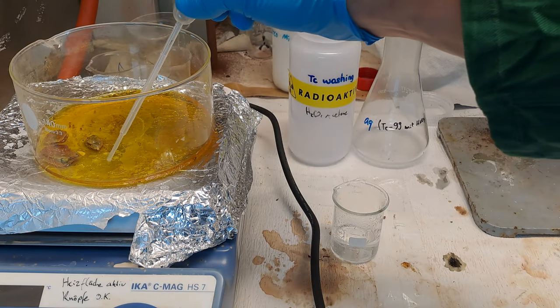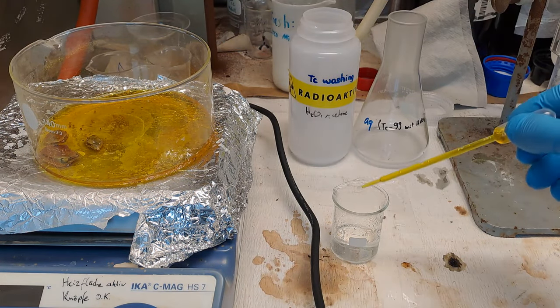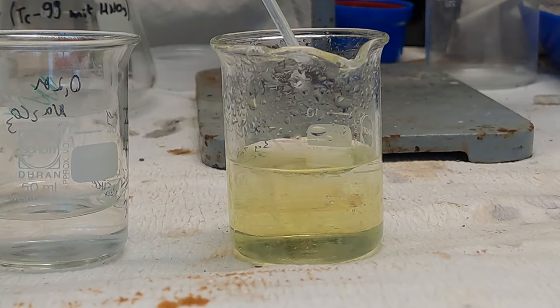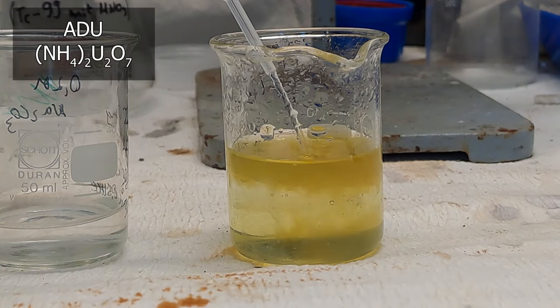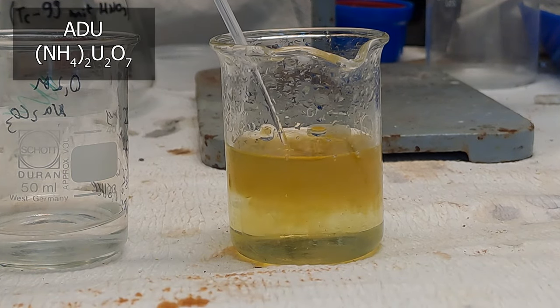Of course, when you have a uranium solution, you should take the opportunity to do something with it. To a dilute sample, we add some concentrated ammonia solution and in the alkaline ammonia environment, a yellow solid called ammonium diuronate forms.